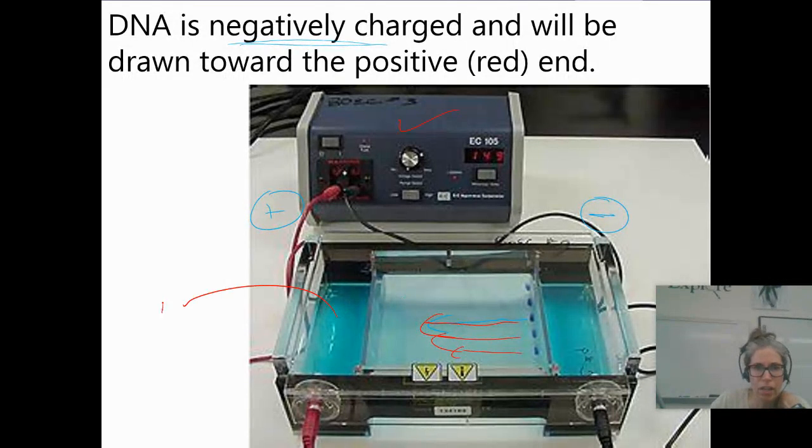This thing has ions in it. It's just some liquid, some water with some ions, electrolytes in it. And you fill the liquid up over the gel, and then you plug it in, put a cap on it, and pull those samples through.